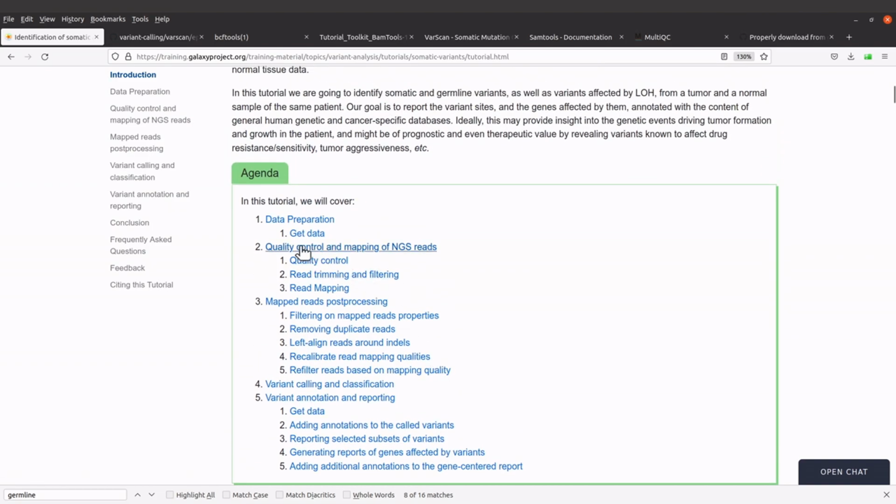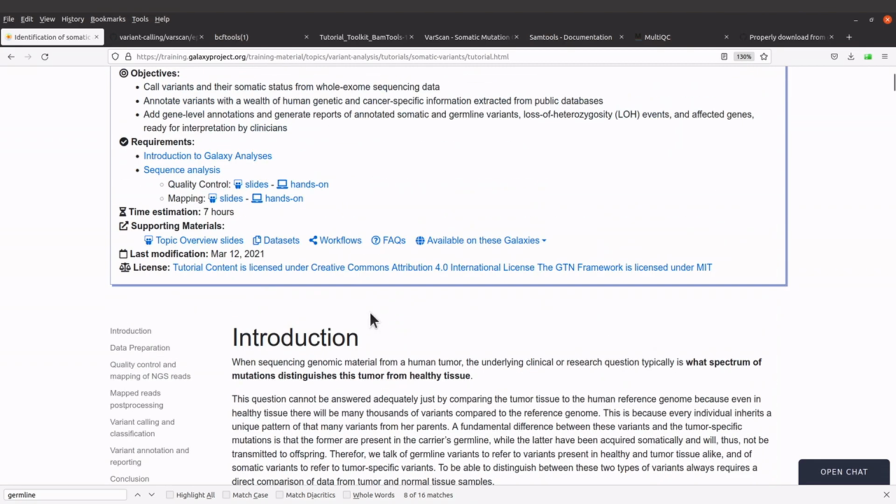And I've also combined some of the activities into scripts. And so when I am executing the scripts, I will explain the codes to you. The scripts are available on one of my GitHub repos. So let's go and then check that out.